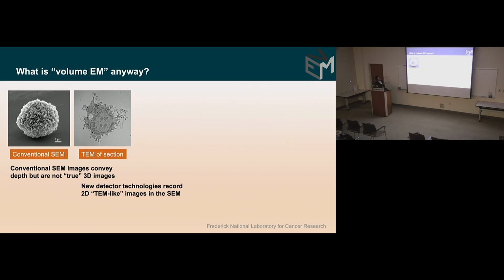Whereas with TEM, you can see what's on the inside and the outside, but the problem is that you're imaging a very thin section of your specimen, right? Several hundred nanometers.